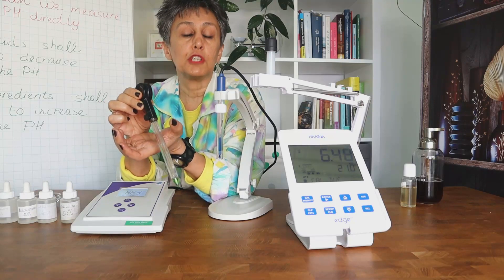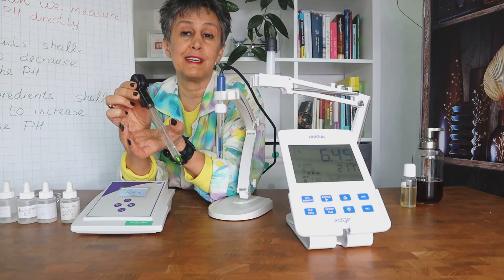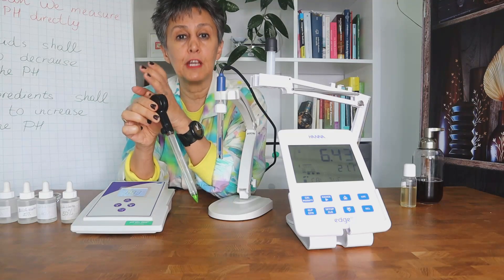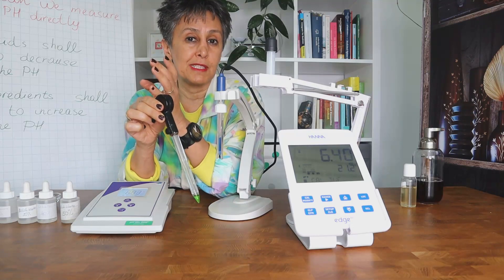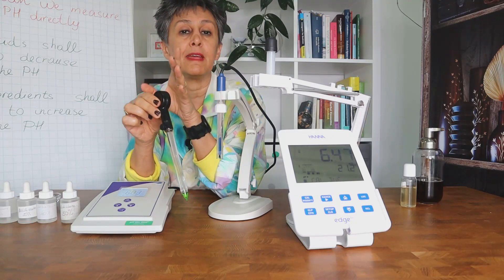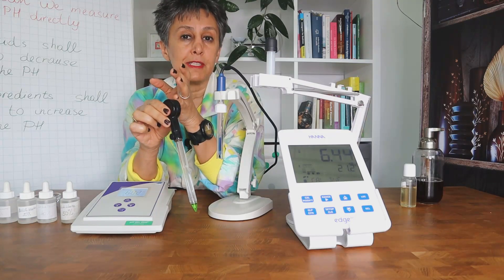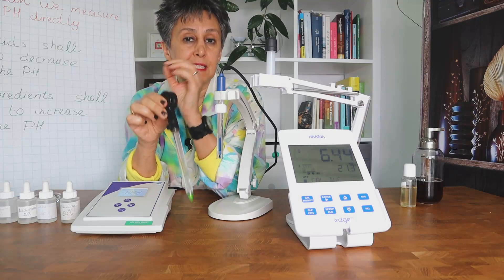You may end up spending more time than if you had simply diluted your sample. So if you can afford such an electrode it is technically possible, but we still recommend that you dilute your sample. Whatever you decide, you must always follow the same procedure — GMP, GLP. You cannot dilute sometimes and measure directly other times. If there are 10 people in your laboratory doing the same thing, they must all use the same procedure and get the same results.